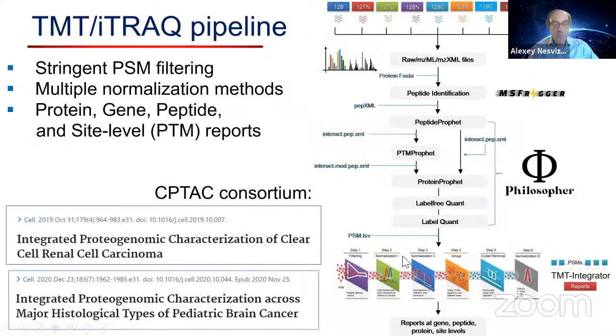Now, I should be wrapping up, and I do have a few slides on TMT and DIA, and I'm going to try to wrap them up in the next 5 minutes, because I prepared a little less for these workflows. But FragPipe fully supports TMT analysis.